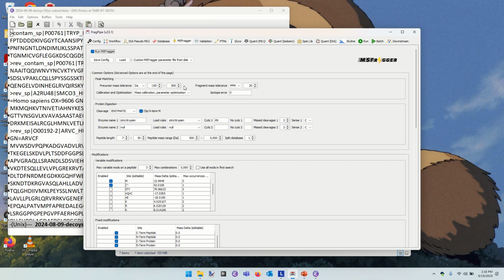Now, if you're dealing with something like complex glycans stuck to a peptide, you probably will need to make sure that the complex glycan structure you're looking for fits within that window. So if it's larger than 500 Daltons, you have to expand that range out a bit. But if you were doing that, you would use that workflow.